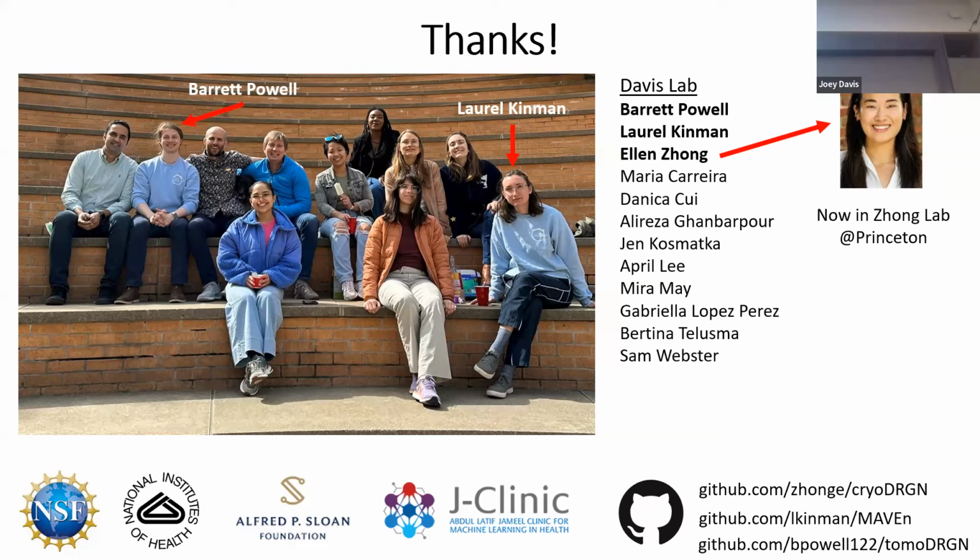Then you do PCA on the volume space, because now those are real-space, molecular, structural changes organized by their variance. So now you can start to look along the reaction coordinate that's the first principal component. When we've done that, we've seen that it's the dominant mode of motion, and then the next principal component gives you a second motion.